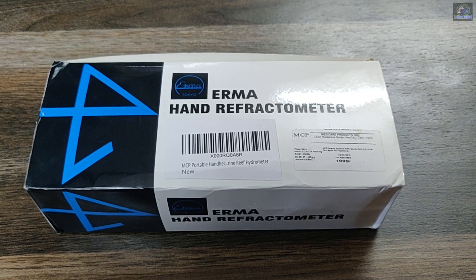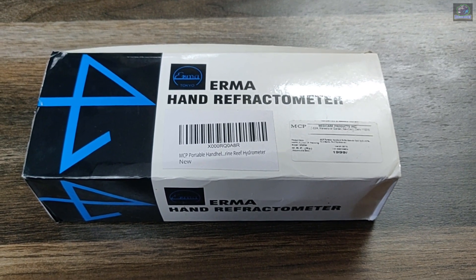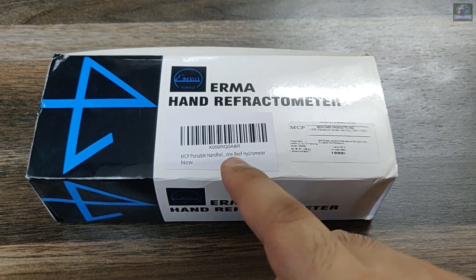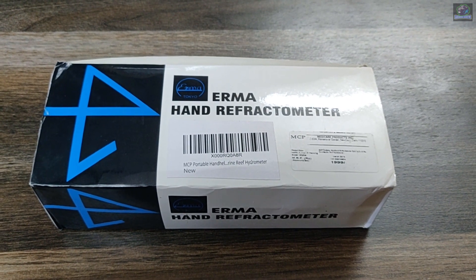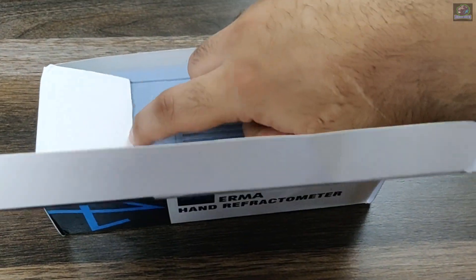I'll take you through a basic tutorial of how to use a refractometer, so stay tuned. This is the refractometer I got from Amazon — it's an MCB portable handheld refractometer. I got it at quite a good rate. Let's open the box — this is how the box looks.